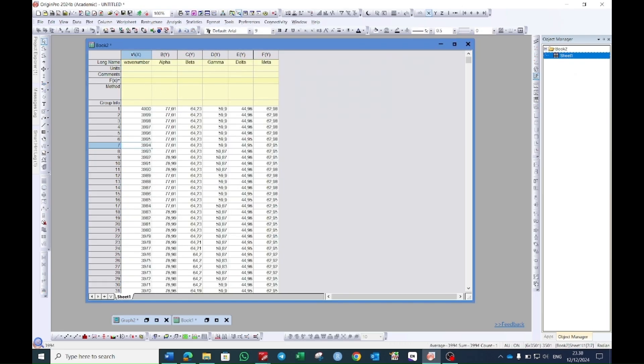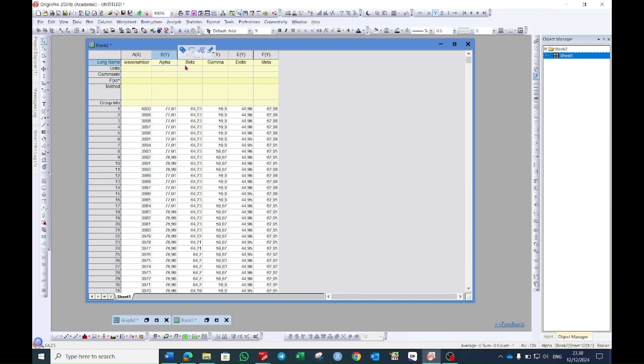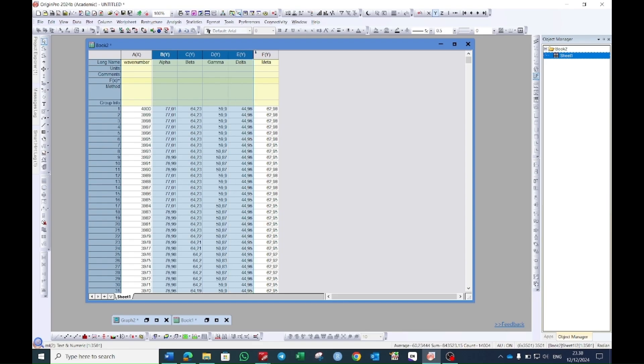So here I have wave number on the x-axis and I have transmittance values of five different samples. So we convert these values into normalized form which is a professional way of doing.